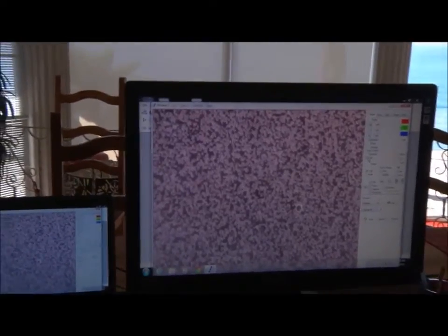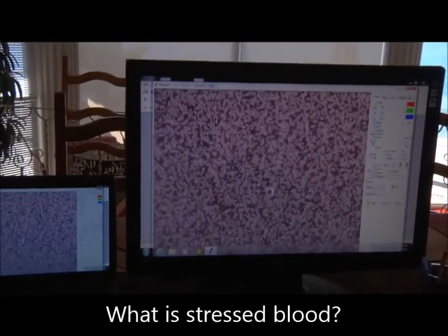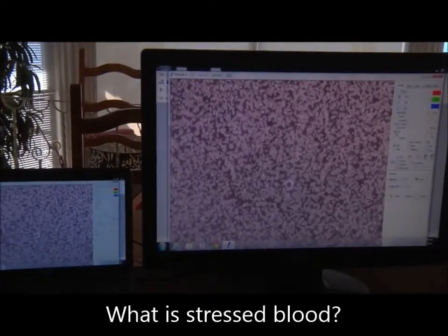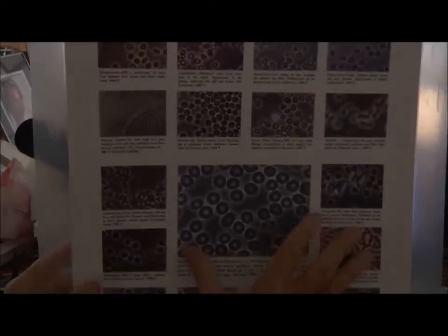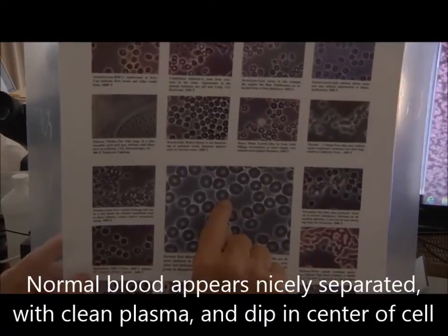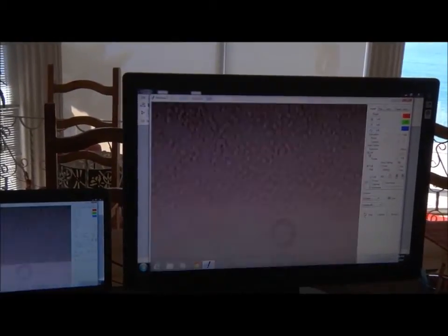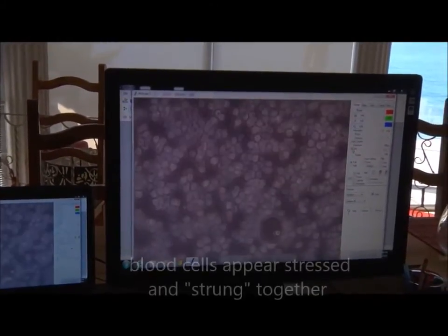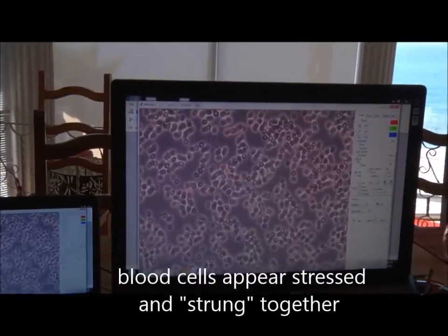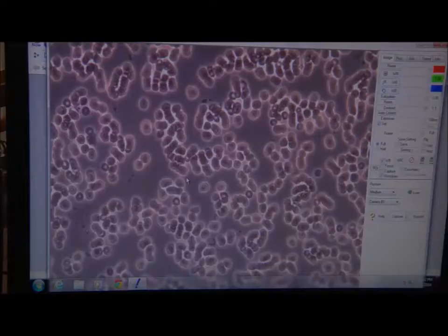That's stress — how come you know that's stress? Let me tell you why. Normal blood, magnified 2,000 times, looks like this — nicely separated, nice and round, plasma clean, little dip in the center of the cell. See how they're all strung together? That's stress, and probably some pain.